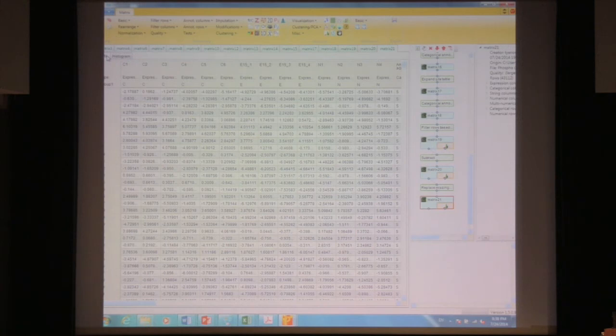The important thing is that you're not imputing large amounts of data, and that you understand how the data is generated. In this case, we know that match between runs was used, and it should transfer identifications provided that the MS1 feature was present.